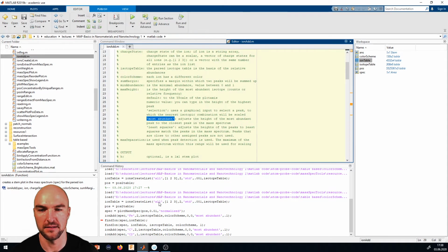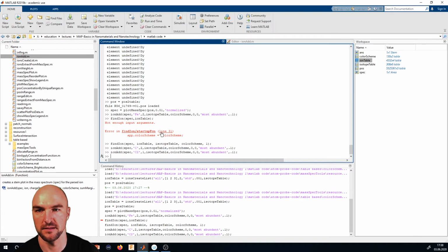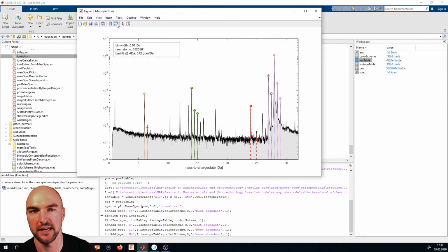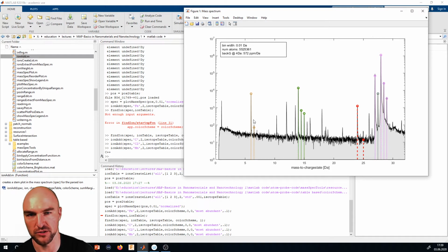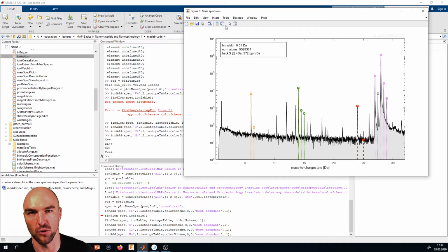I think that's just for showing stuff right now. That's enough. Probably I should also put manganese in. Manganese would be 2+. And now I've got my ions marked in the mass spectrum. And if I switch on the legend, then you will see which one's which. And the more dashed, the more solid the line is, the higher the charge state, essentially. If you click on the individual ions, it will just spit out which one it is, so you don't always have to switch on the legend.